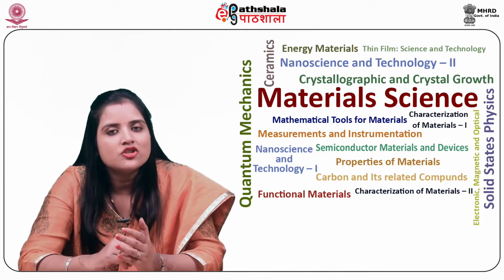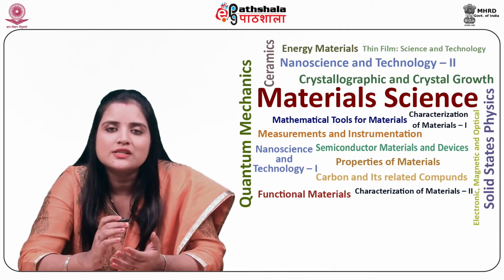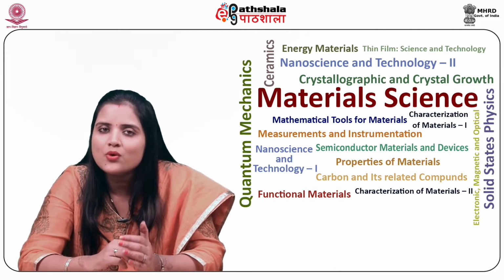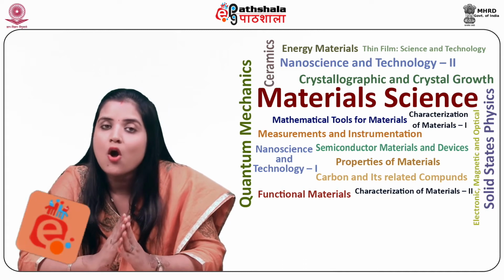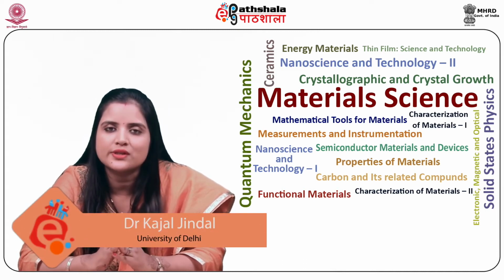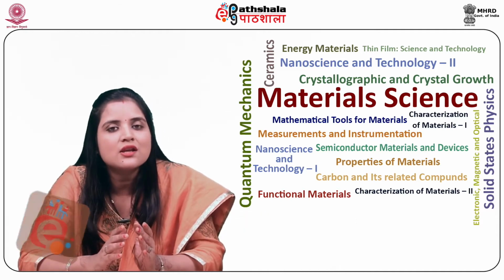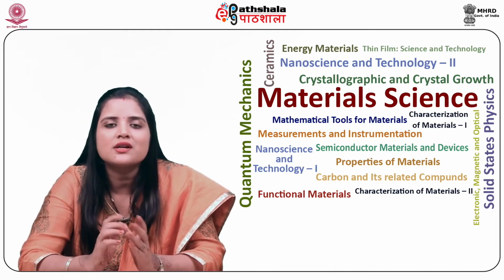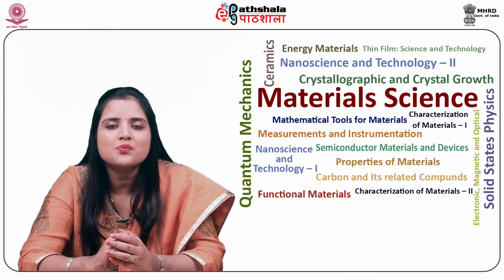Third, the instrumentation of EDAX along with the description of components was given. Fourth, methods of qualitative analysis of the X-ray generated EDS spectrum were discussed. Finally, quantitative analysis was also described along with non-conductive specimen analysis. Thank you students for your attention.